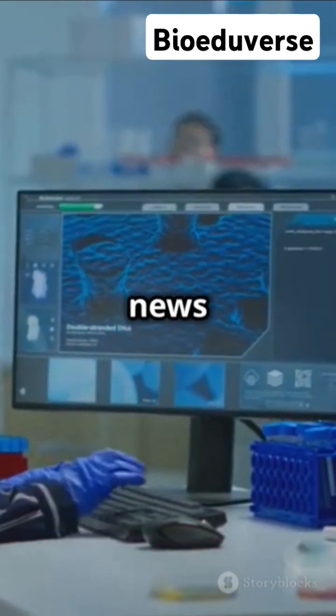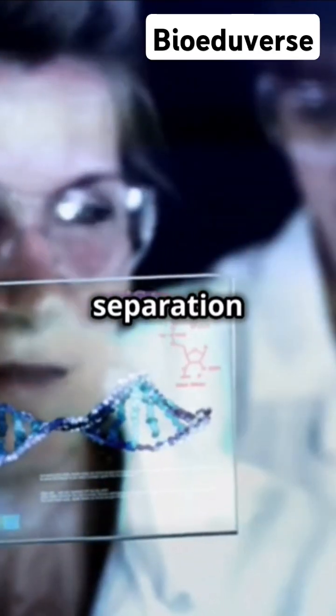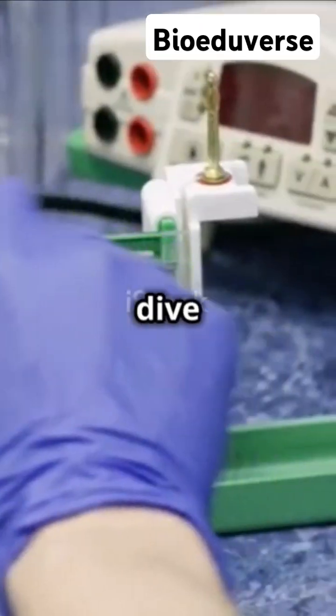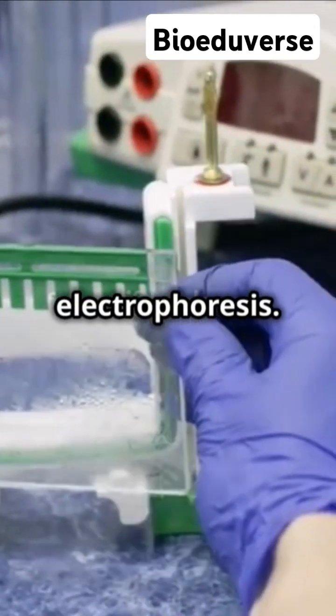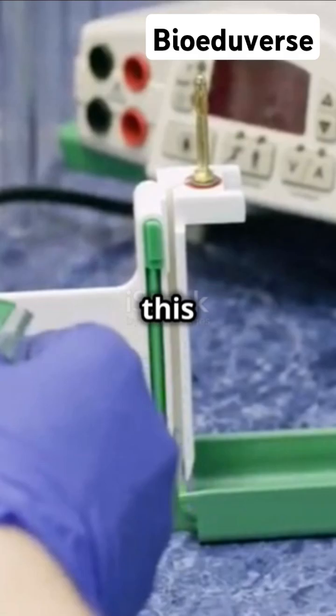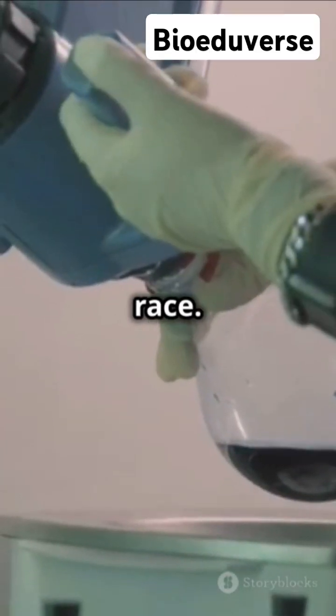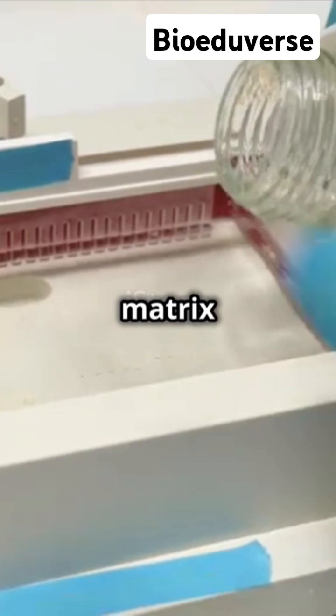I'm sure you've heard the news — DNA separation just got a whole lot simpler. Let's dive into gel electrophoresis. Picture this: gel electrophoresis is like a molecular race. We use a gel matrix as the track and an electric current as the starting gun. Our runners? DNA, RNA, or proteins.